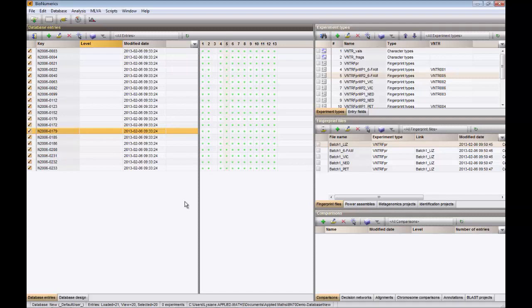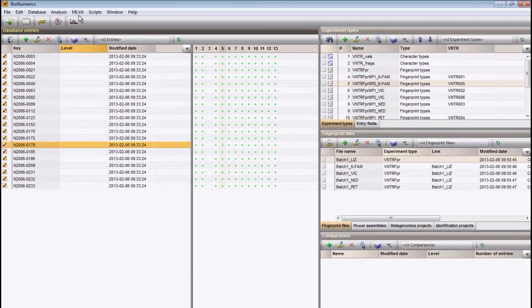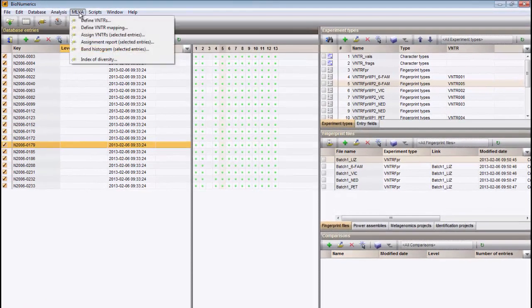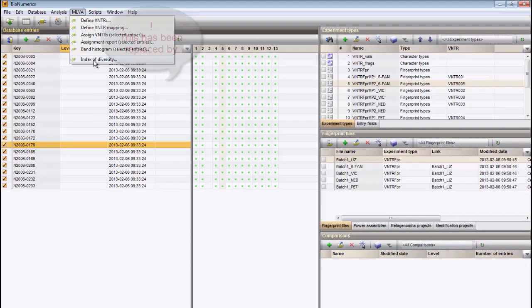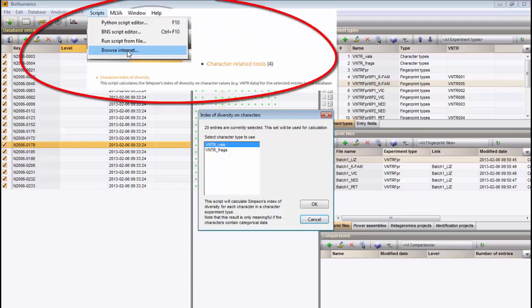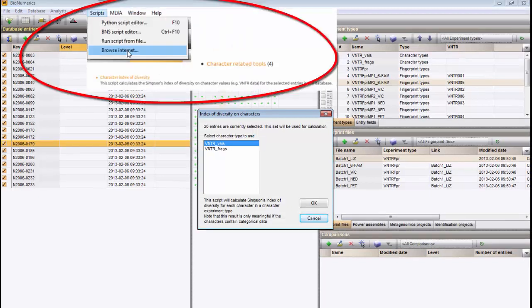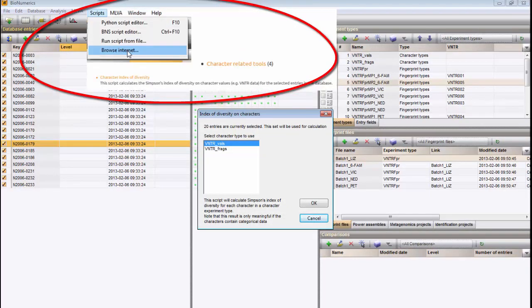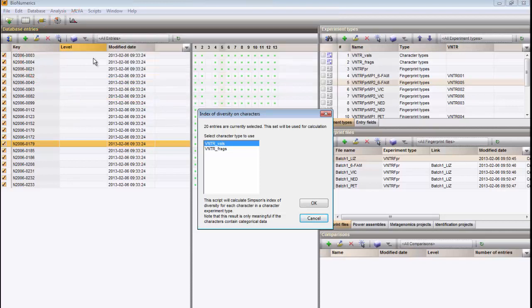Select all entries of the VNTR experiment and choose MLVA, Index of Diversity. This brings up a dialog box listing all character types present in the database.